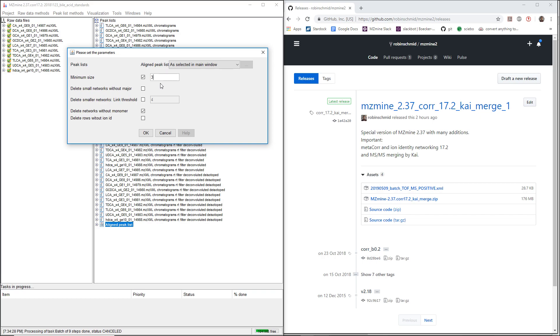If we only have two, this is just the Mz difference of M plus H and sodium. But if we have a third one, this is going to be more accurate and we can believe in it without looking at it manually.